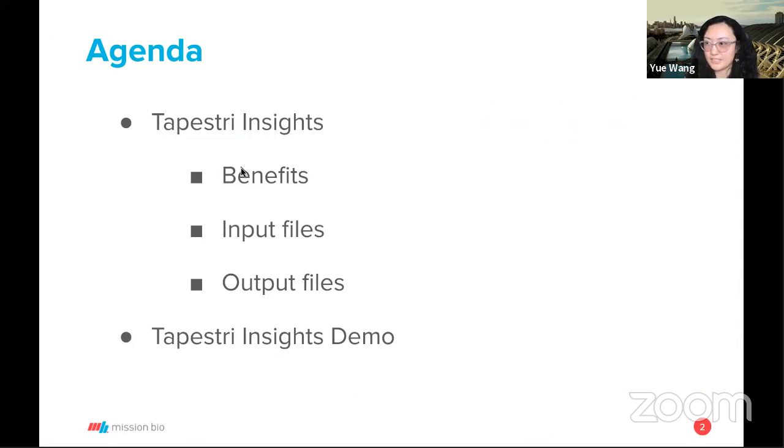The agenda for today is composed of two parts. At first, I'm going to make a brief presentation on the benefit of using Tapestri Insights, what kind of input file you would need, and what kind of output files you can expect after using Tapestri Insights to perform the analysis. And second, and most importantly, I'm going to do a live demo on how to use Tapestri Insights to analyze real patient data.